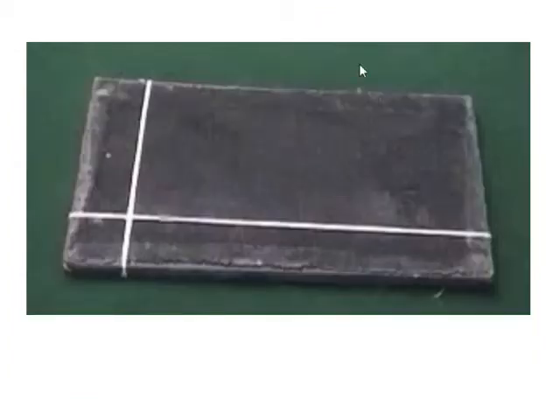This is a velvet pad wherein you can arrange the fibers in descending order, for which this experiment is actually carried out. This is a plastic scale kept on the velvet pad. This is used for tracing the edges of the arranged fibers. When we arrange the fibers in descending order, we can then trace that on this plastic scale.